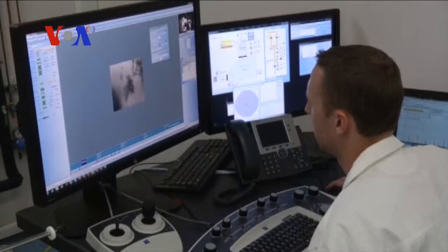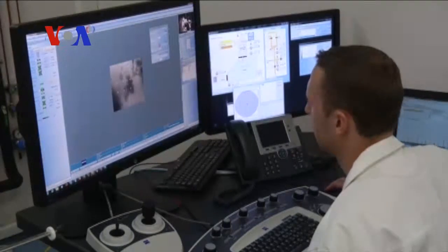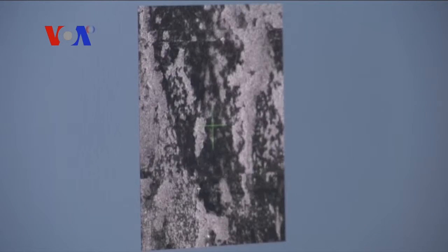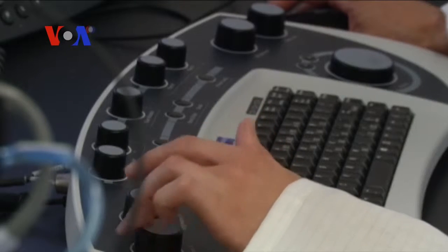David Dowsett with the Luxembourg Institute of Science and Technology says the addition of a super-resolution analysis instrument gives the microscope its additional capability.